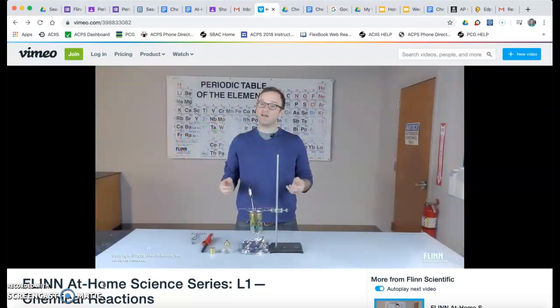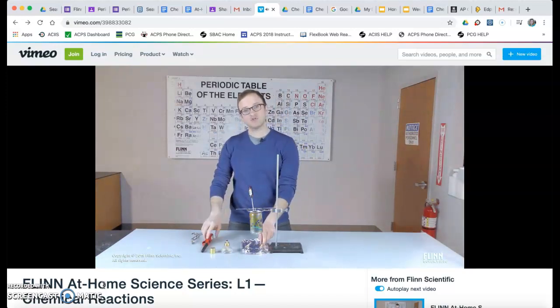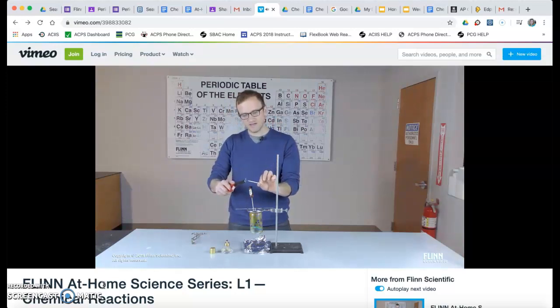In this lab, we are trying to make sense of forest fires. Now, in order to do that, we have to get to the scientific principle at the crux of forest fires, and that is a chemical reaction, more specifically, a combustion reaction. Now, I'm going to show you a scaled down analogy of a combustion reaction of a tree by burning this wood splint. Now, if I ignite this, what you'll notice is the burning or combustion of the splint.